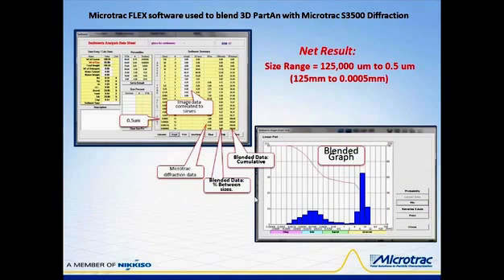On the next slide, what I'm showing is a screen from Microtrac Flex software where the diffraction instruments are being made. And this particular feature in the software allows blending of very, very large particles or even very, very small particles with existing other data. Now over on the left, one of the things I want to point out is the weight of fines.